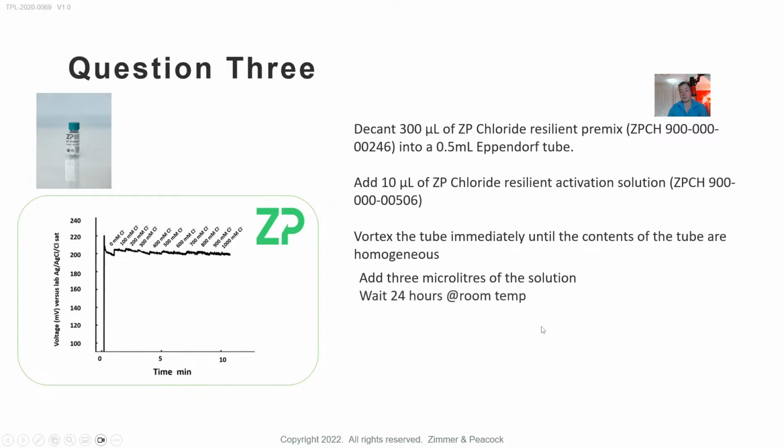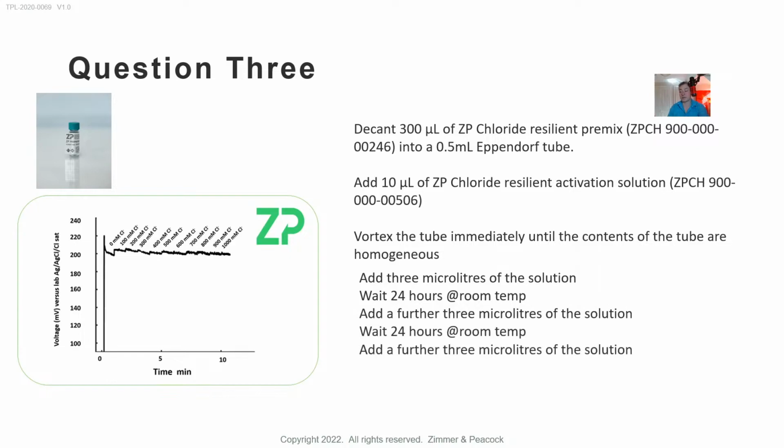Wait 24 hours. I mean, this is at room temperature, and repeat that actually 3 times. Now that means that's 72 hours. I would describe that as not terribly optimized. I mean, these are just guidances we give people to kind of start with.